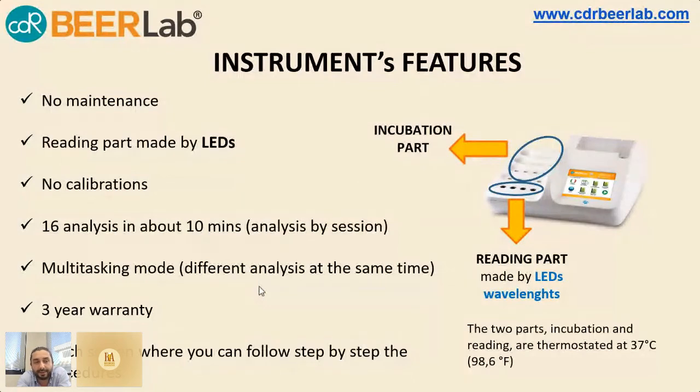different samples at the same time, so you can perform up to 16 analyses at the same time, or you can work also in another way. You can analyze different parameters at the same time. Of course, in this case, you need to manage different cuvettes on the analyzer.